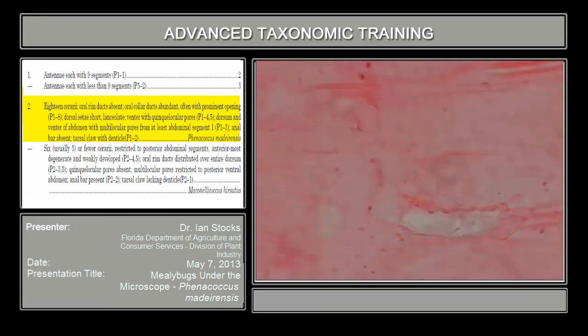The ostiole here, this is a posterior ostiole. It's a paired structure, and it can be present also on the anterior, just adjacent on either side of the mouth parts. The most obvious way to pick up an ostiole is to look for this heavily sclerotized curved area here. It's going to be kind of lip-like, okay?